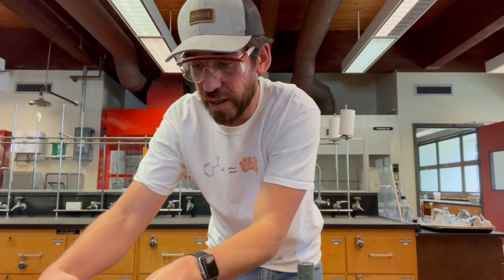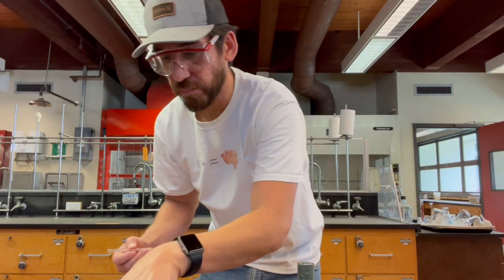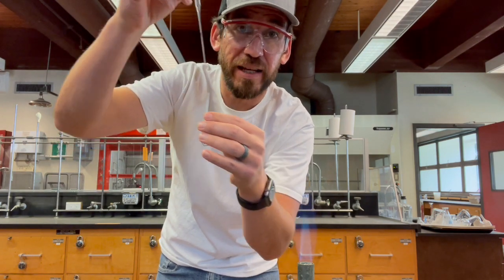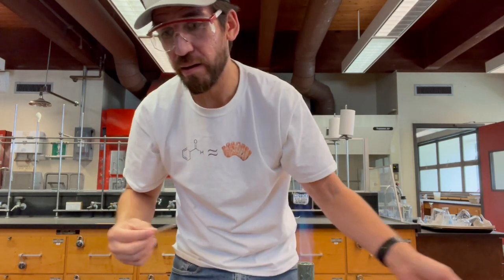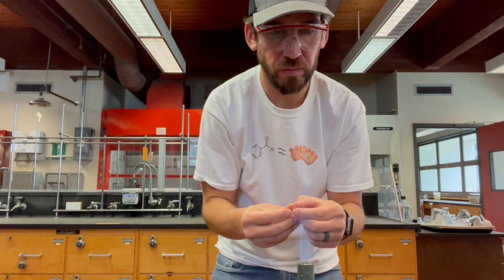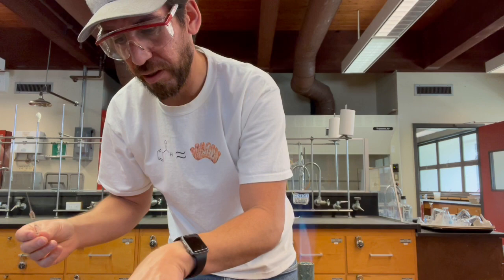So now what I need to do is transfer a little bit of the ethanol solution to that boiling point tube. But here's the thing, it doesn't fit. They're like the same size. Okay, so what do we need to do? We need to stretch that bad boy out. Actually, I feel like I could just use the one I already made, this first one. Remember I was playing with it.